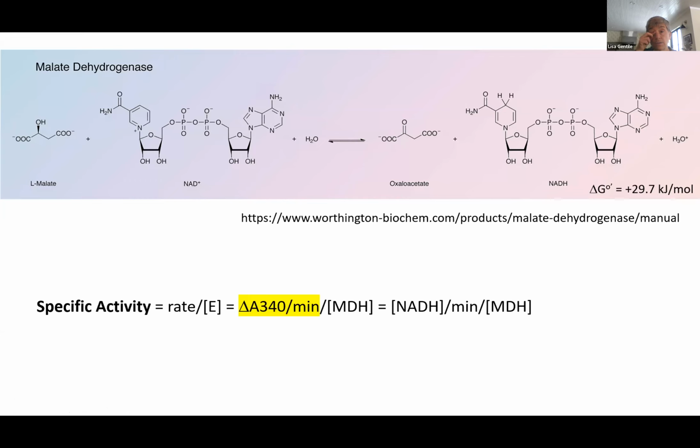And to measure the rate of a particular reaction, you need something to measure a change in. And NADH provides a really nice visual way for us to measure a change in this reaction because it has an absorbance at 340 nanometers. So what we're going to do in this reaction is measure how NADH gets used up. So we'll start at some level of absorbance at 340 nanometers, and it'll decrease over time. And that's what we're going to be monitoring.